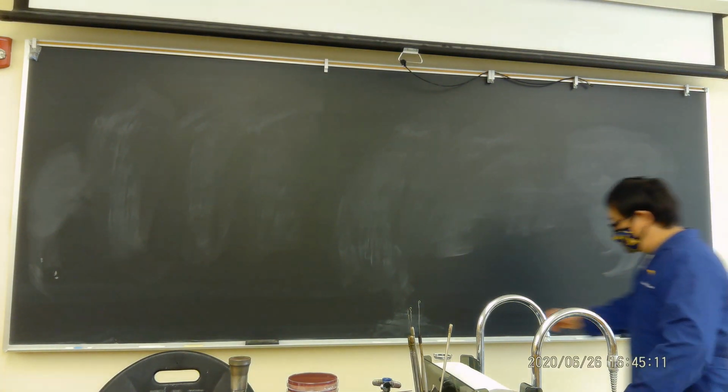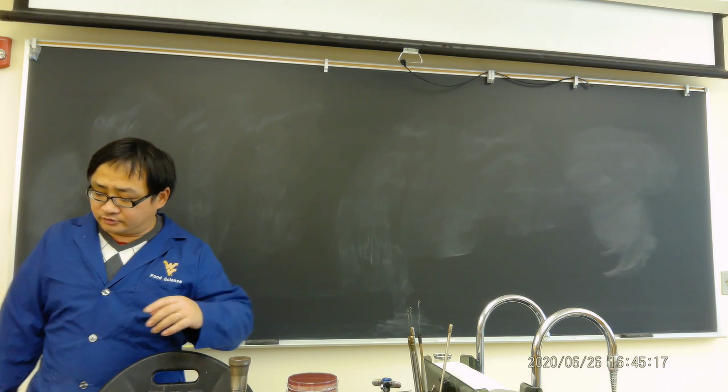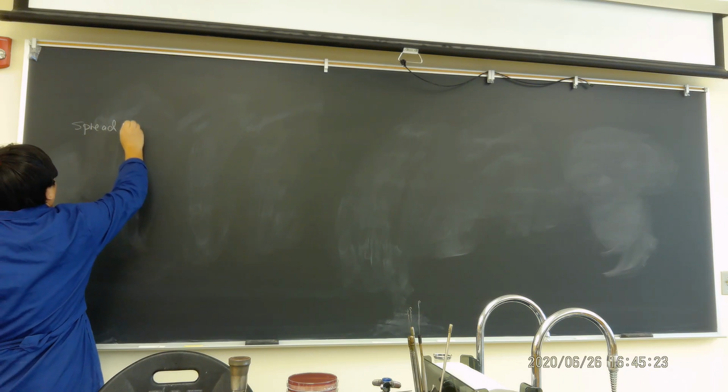Okay, so let's have the class. What we will talk about today is, first of all, we want to see the results of the spread and pour plating.